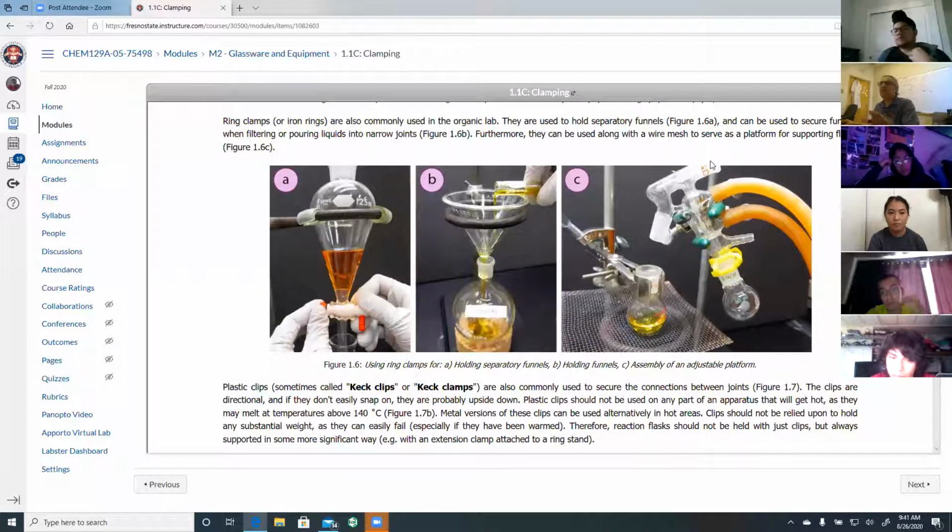You can see how passionate I get about some glassware. I actually have a fetish for syringes. I'm not a maniac. I'm a pretty normal, harmless human being, but I love syringes. There can be gas-tight syringes, liquid-tight syringes, syringe pumps. They're awesome. I like gadgets.